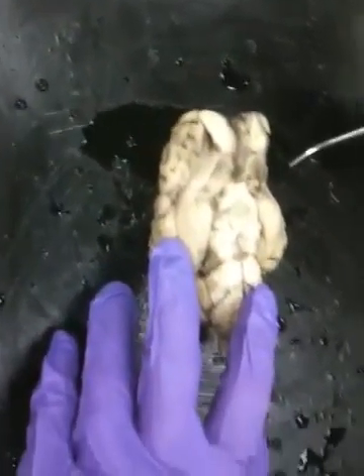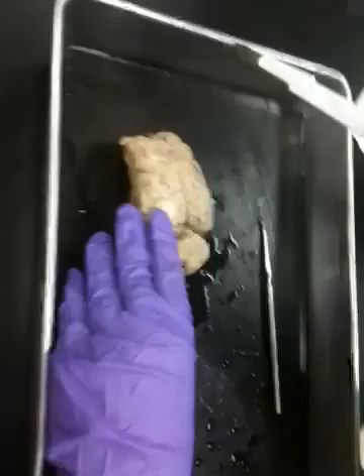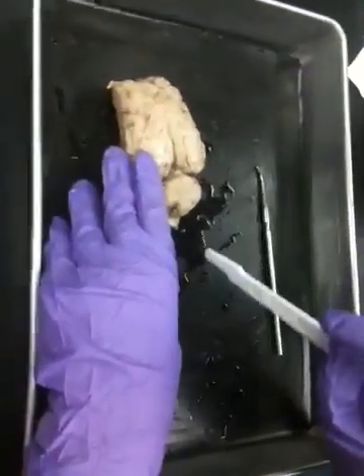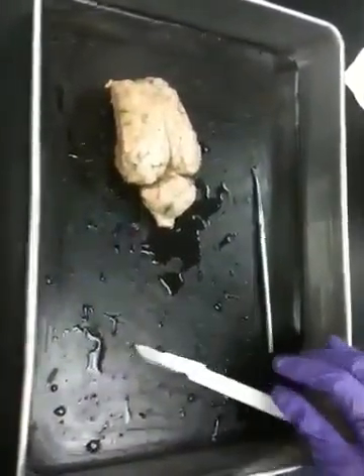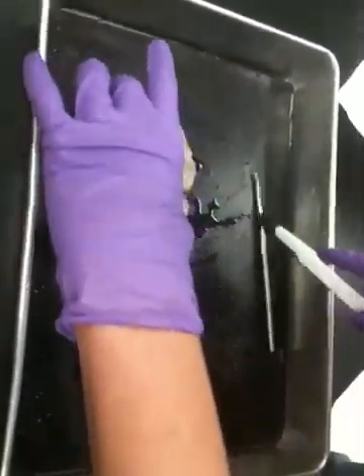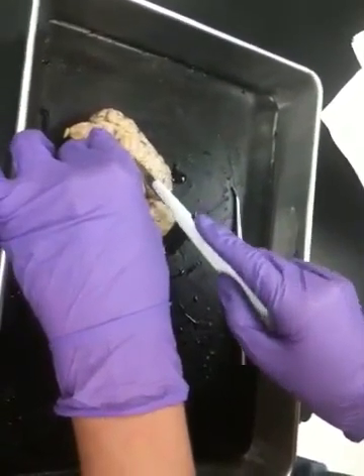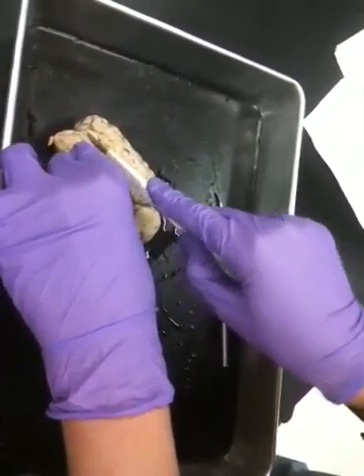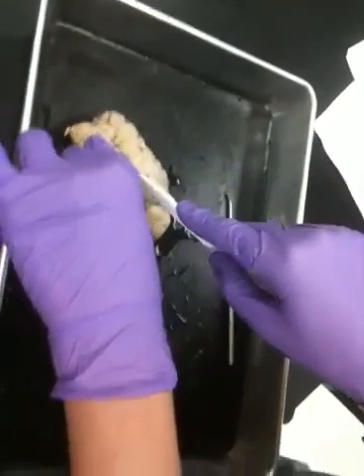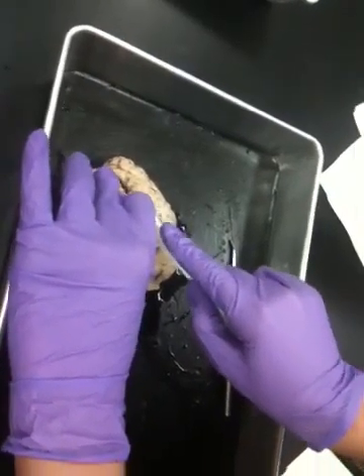Okay. Ventricles, lateral, third. To do that, now we get to dissect. So I'm going to leave one of you to do it because that's the fun of it. You're going to go all the way down and completely separate the two halves of the brain, all the way through the cerebellum and the brainstem. Pull them apart, and then just cut through. It's pretty easy tissue.